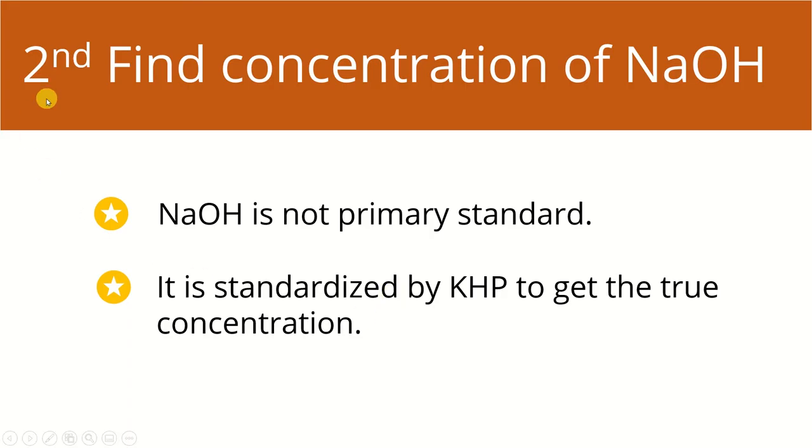Next is the second part. You're gonna use the KHP solution to find the true concentration of sodium hydroxide. This part is called the standardization. Sodium hydroxide is not a primary standard because it takes on the humidity in the air very easily. So the purity of the solution that you prepare is not correct.